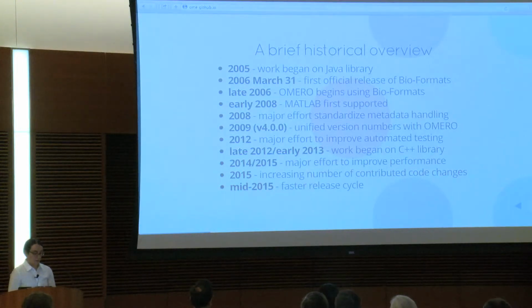Around the same time, and based upon feedback from the OME community, we realized that a Java library alone wasn't going to be sufficient for many people's needs. So in late 2012, early 2013, we began work on a C++ version of the Bio-Formats API.